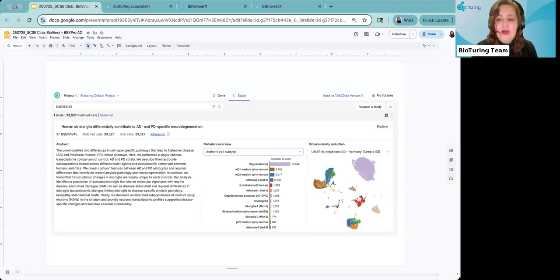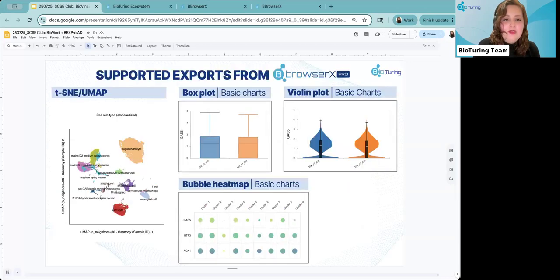So really, how can we look at subpopulations and see if they're within activated states, or are they cell types that might be changing specific signatures and might diverge into different transcriptomic differences, or are we looking at heterogeneity across specific subpopulations? So that's the case study we'll go through.